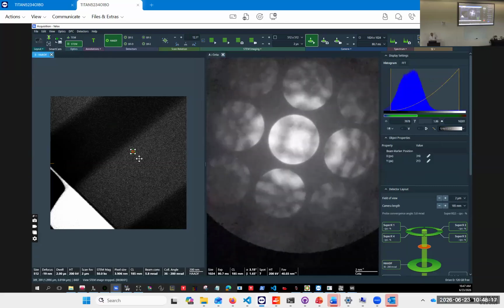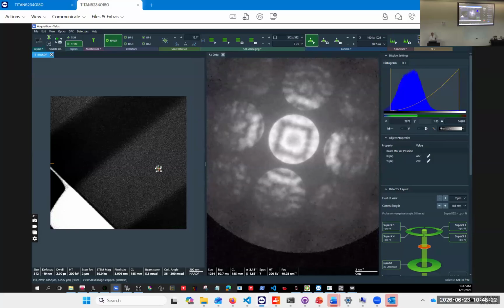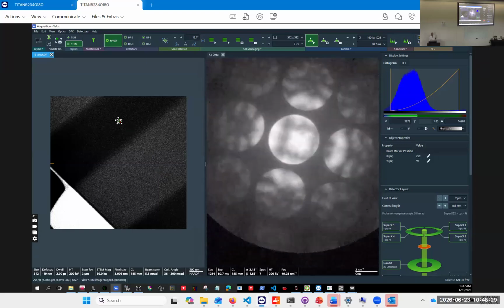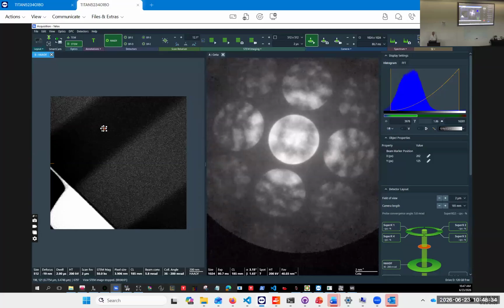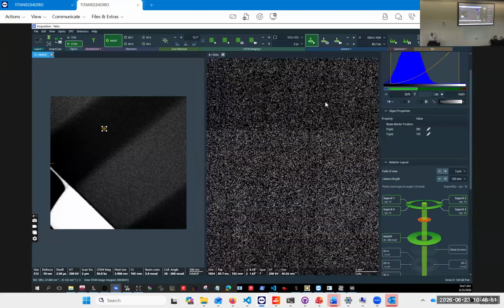The thickness is directly related to how many dynamic diffractions you have, and we'll figure that out as we go along today. So this is thin bits, thicker parts, thin and thicker ones, so we can check that and use that. If you want to do the whole thing together with the high-angular dark field detector, we go back to it. We looked at the high-angular dark field detector before.